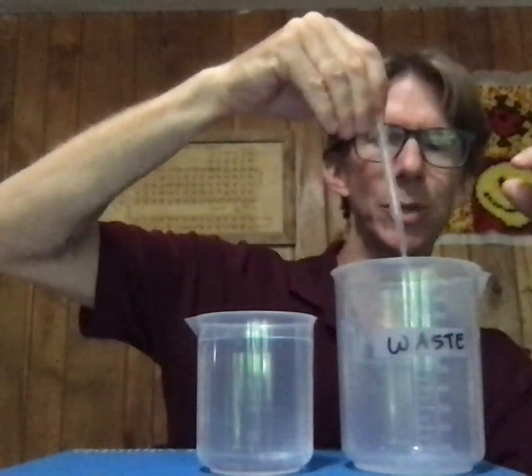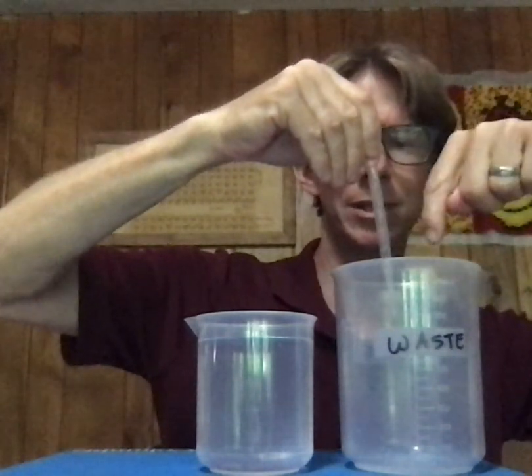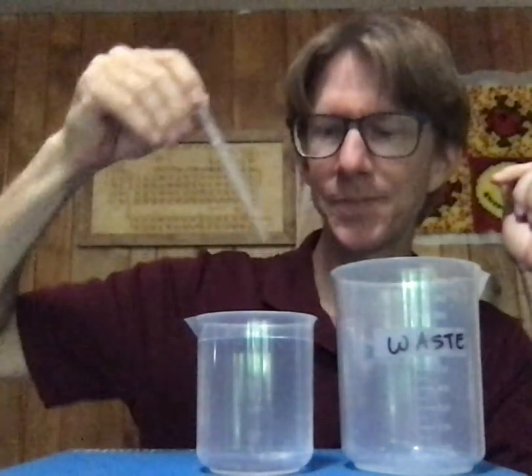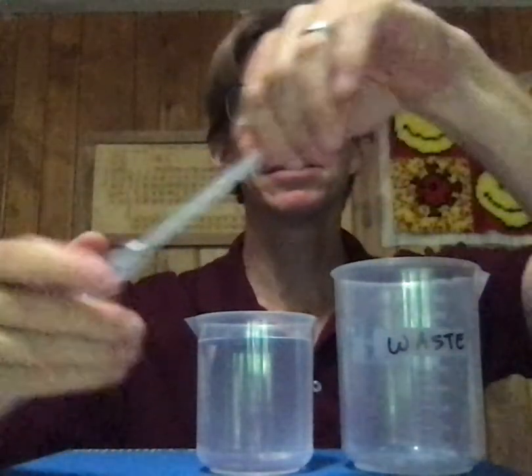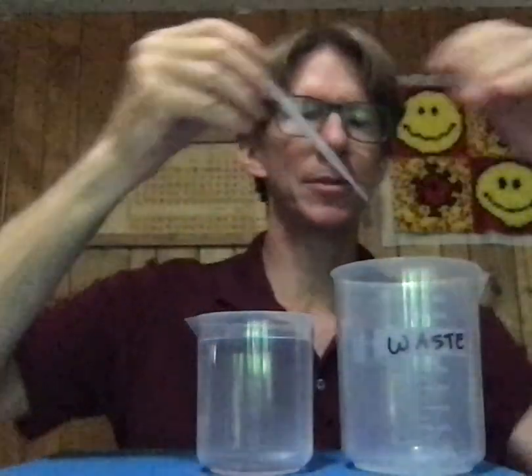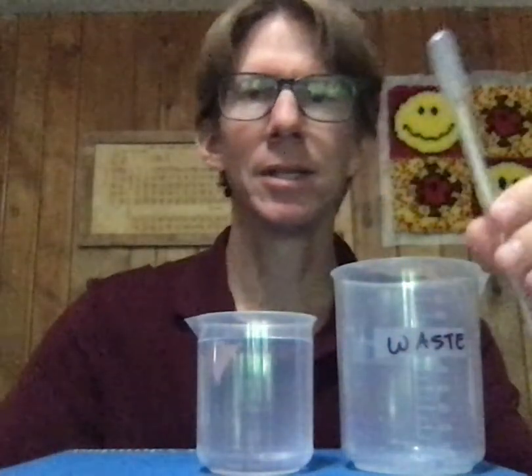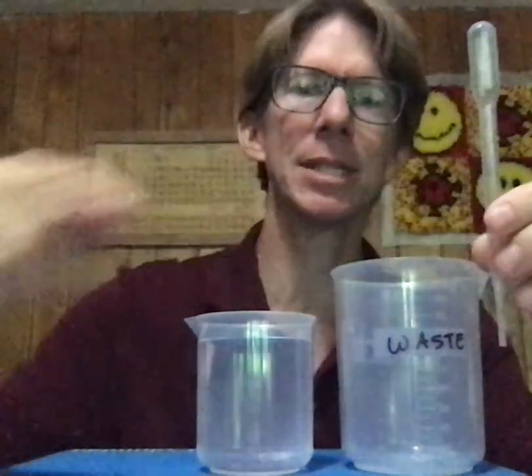You'll notice that I am squeezing it over here so that any leftover solution that comes out goes into my waste and does not go back into my distilled water. Third time — a little bit of solution, coat the entire interior. And now you can be relatively certain that any bit of solution that's in here is water and not anything else.